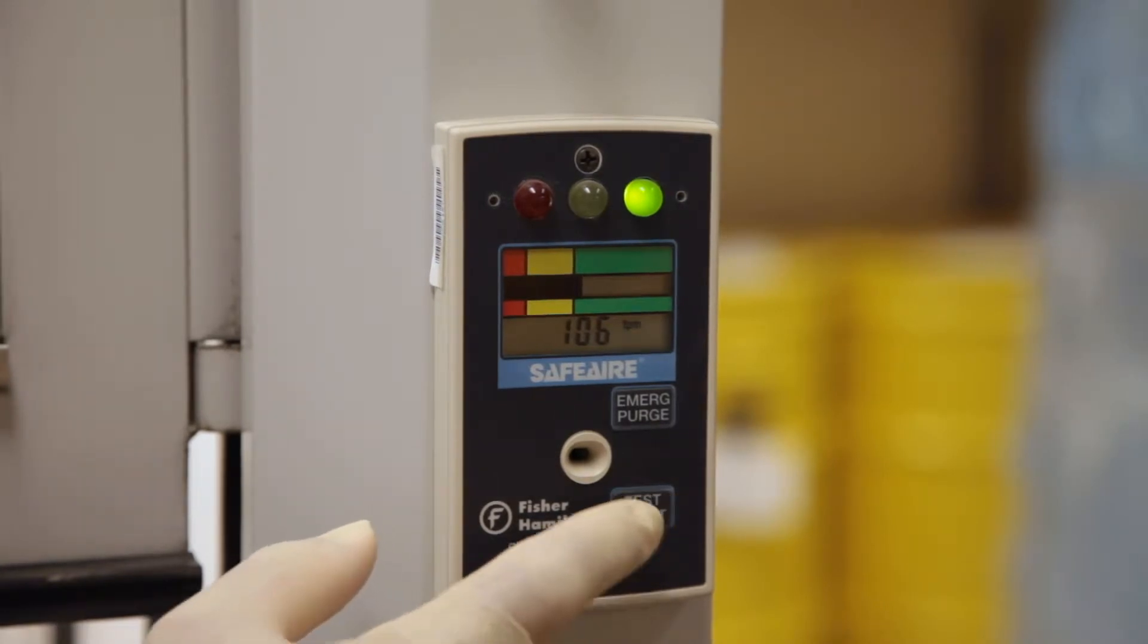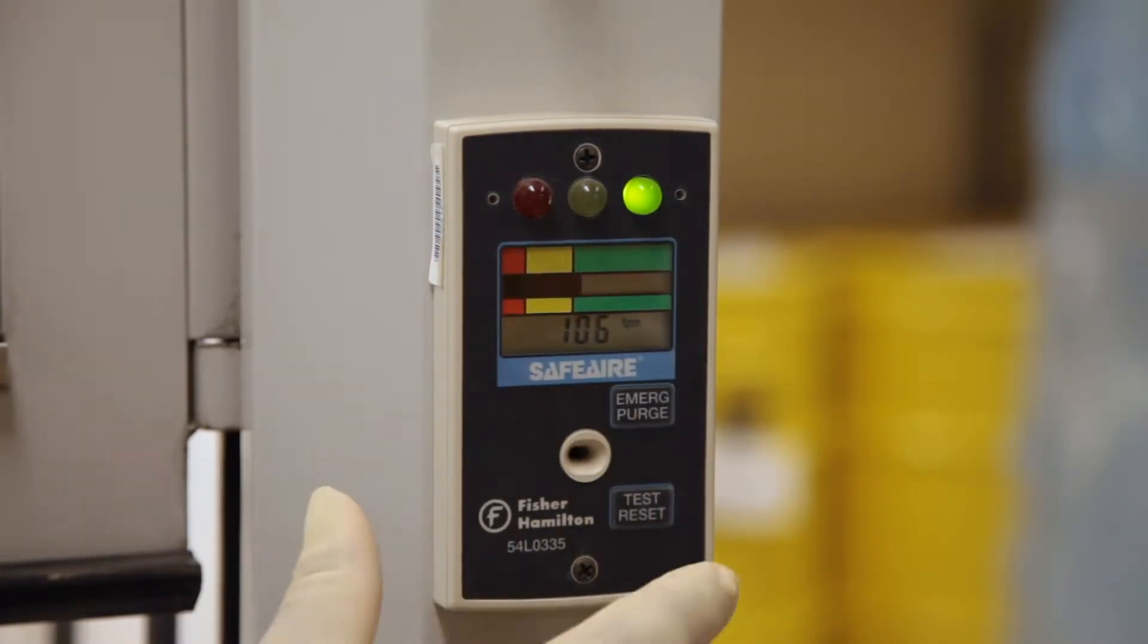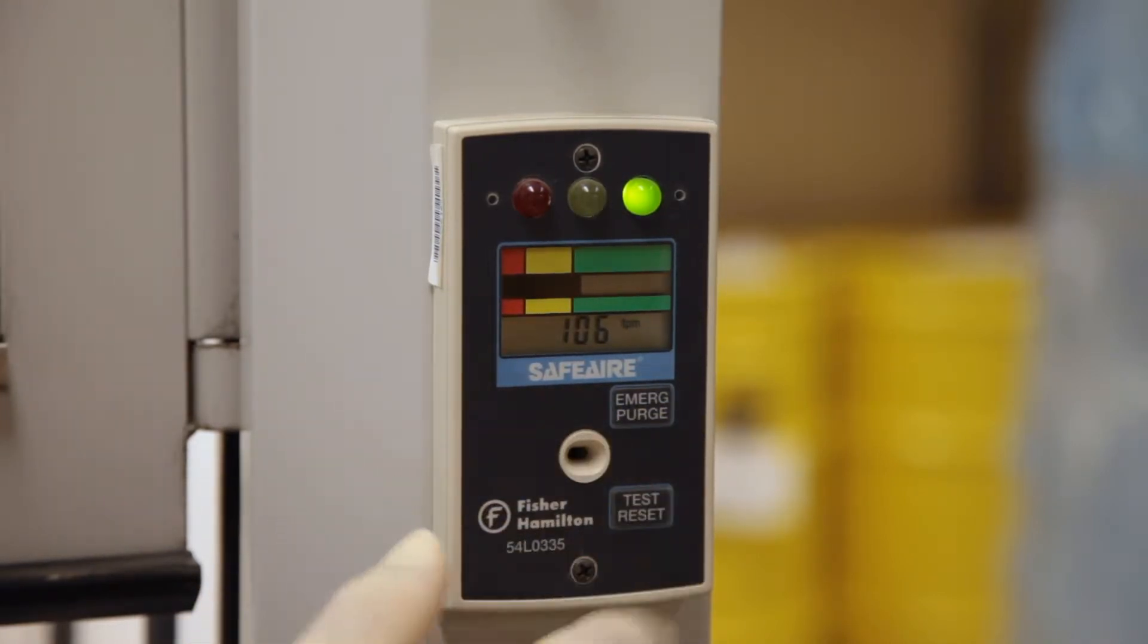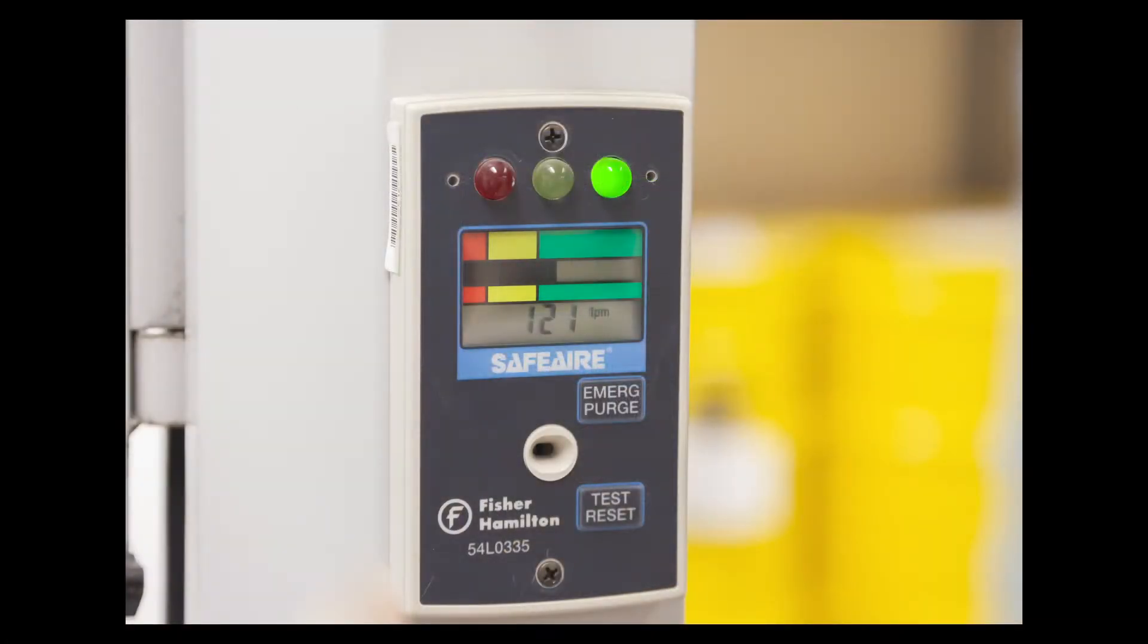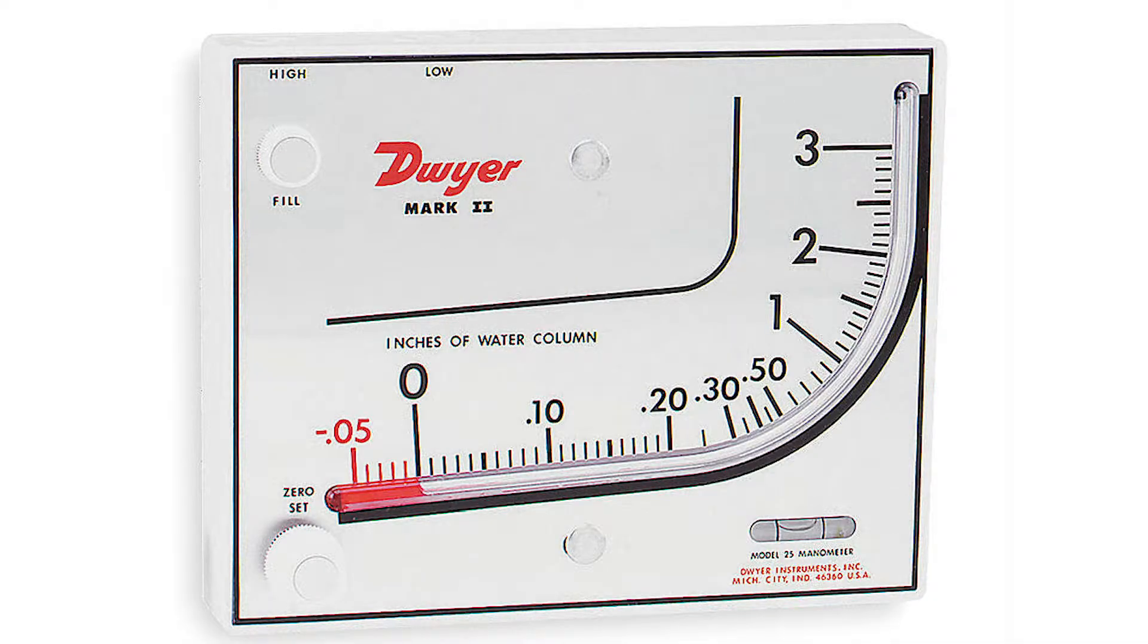All laboratory fume hoods at UCSF are required to have airflow monitors which indicate whether or not the fume hood is operational before use. There are several types of airflow monitors including digital airflow display, magna helic differential pressure gauge, and incline manometer.